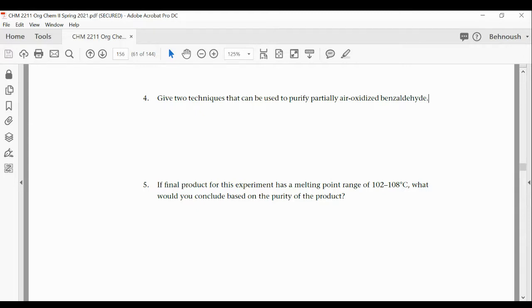The other method is extraction using sodium hydroxide. When you say extraction, that means you are adding... Which one is that for, the vacuum distillation, Charisse? For vacuum, yes, vacuum distillation is used because we want to make sure that distillation happens at low temperature.